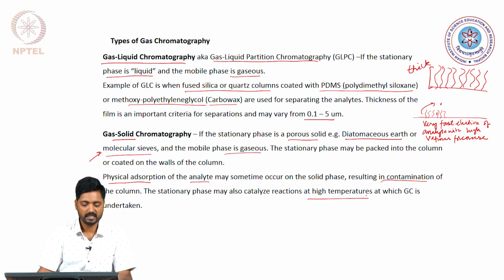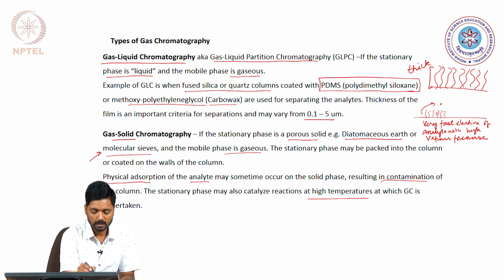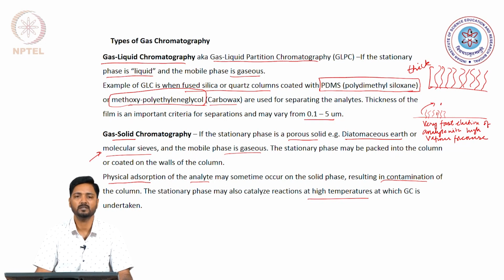Please note that the previous examples of having polydimethylsiloxane or methoxypolyethylene glycol for gas liquid separations carefully chose these stationary materials because of their inherent inertness.